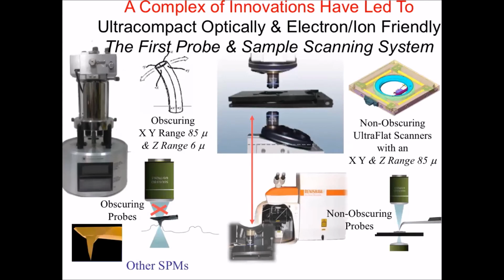Now we come back to near-field optics, because this has the potential to do some of what I'm talking about in terms of PALM and STORM and come up with something else. And that is that in PALM, STORM, and SIM, okay, you do not have any solution to the Z problem without bleaching the fluorescent dye. That's terrible. In near-field optics, that's not the issue. You'll see what I mean in a minute, okay?